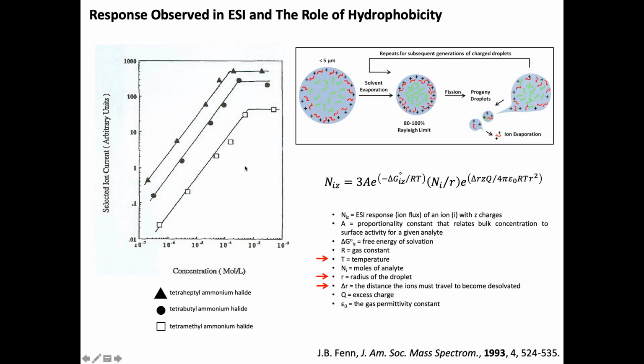Yeah, I was actually wondering, if you change the organic composition of your mobile phase, and you increase it to, like you were showing before, like 70% or something? Yeah. So at that point, would you expect your heparan sulfate to ionize faster because you have more organic character in the mobile phase?